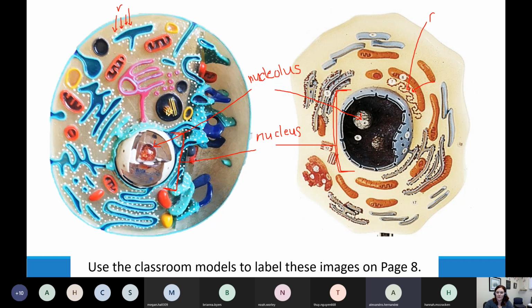the soup of the cell, or they're found attached to that thing we talked about in lecture called the rough endoplasmic reticulum. Rough ER. The rough ER is all of this stuff that's blue and has the white spots on the outside of it.